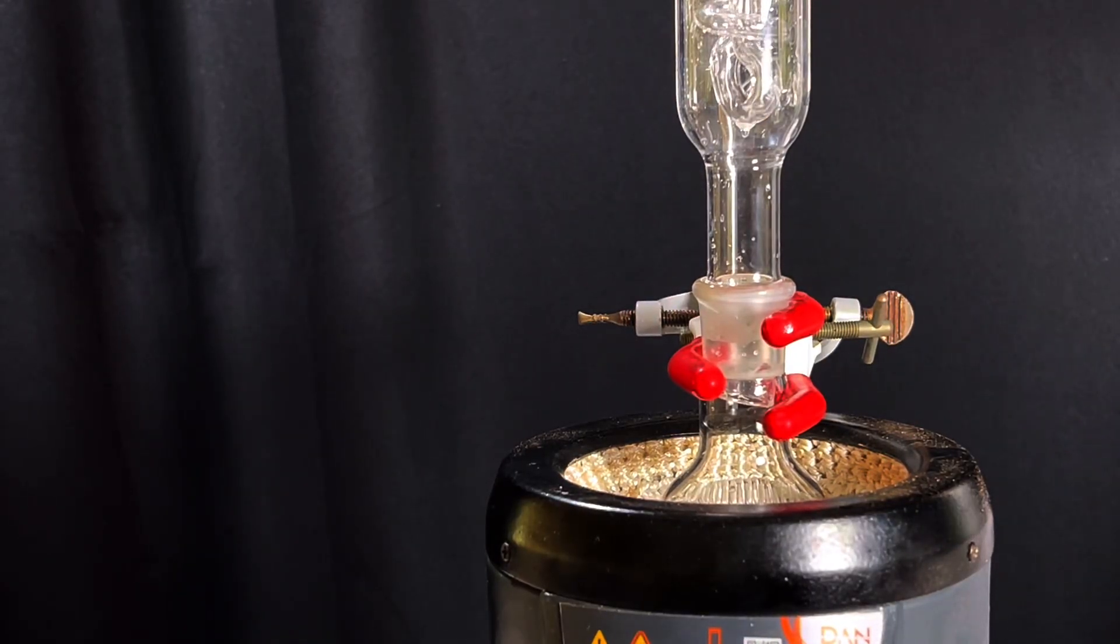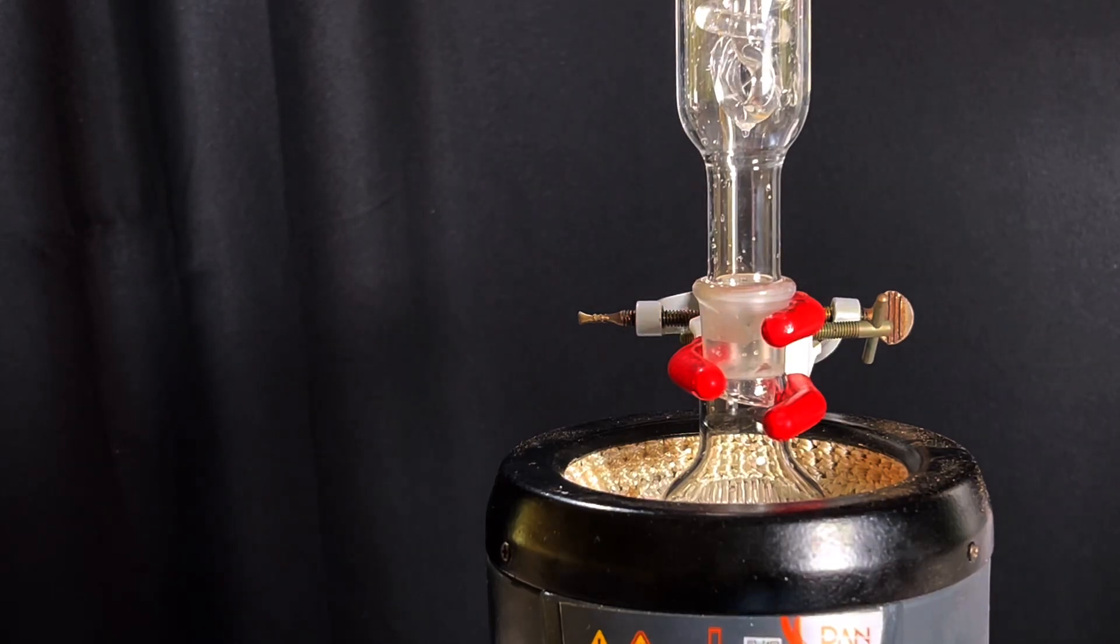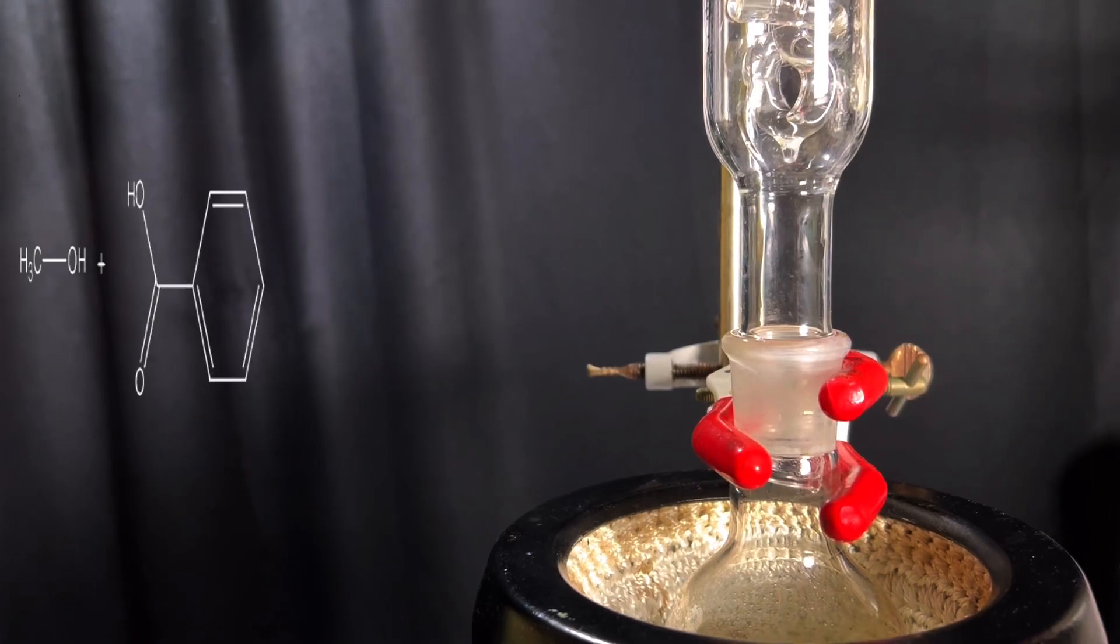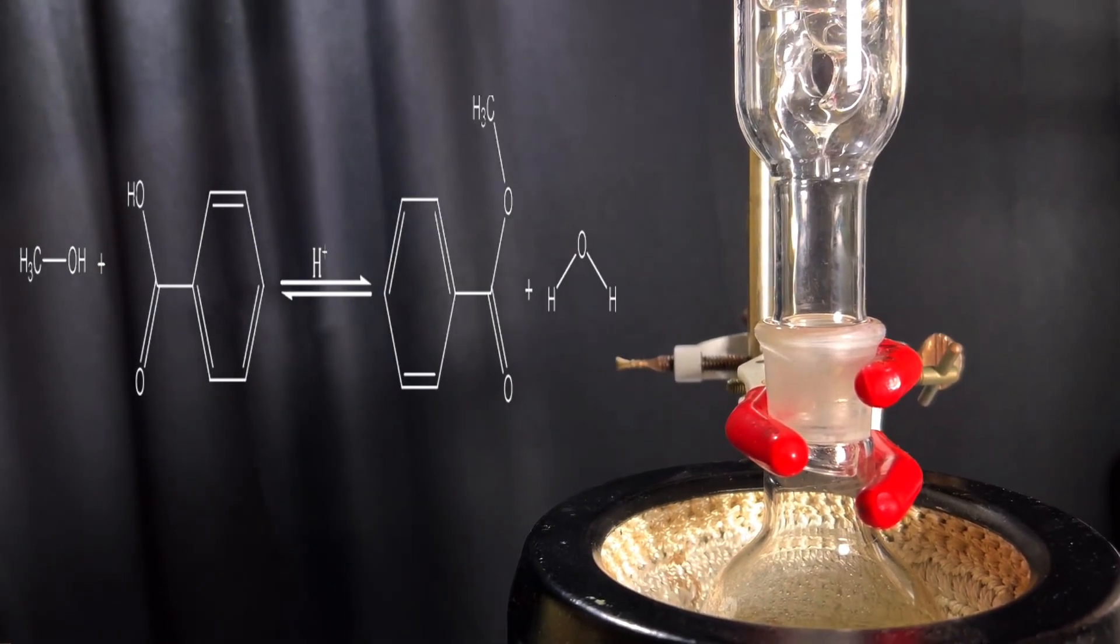Now lower the flask to a heating mantle and then reflux the solution for 4-5 hours. What's happening here is called the Fischer Esterification Reaction where benzoic acid reacts with methanol in the presence of an acid catalyst to form the ester methyl benzoate.